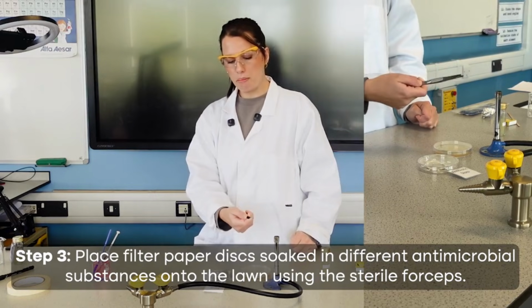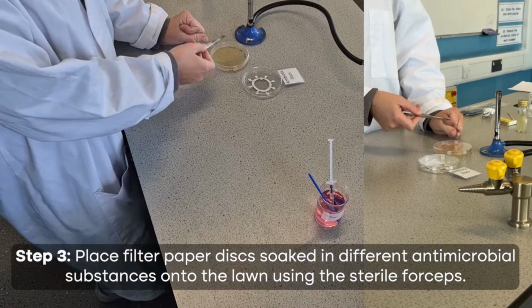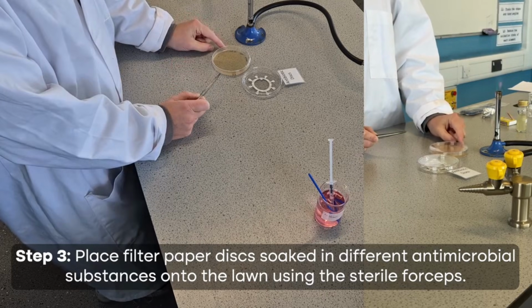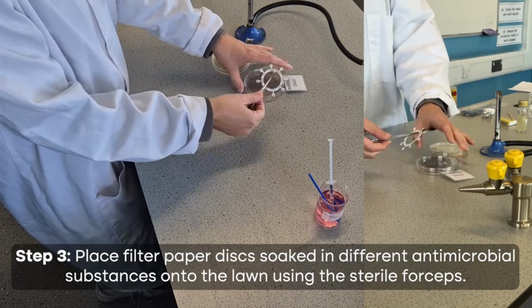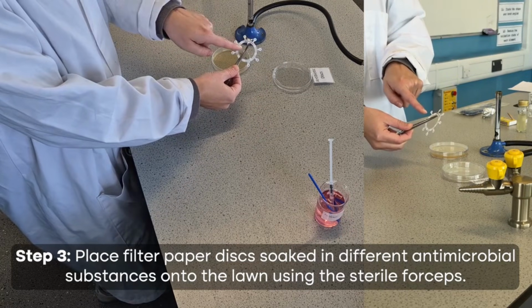But because I've now put them in the Bunsen burner, I do just need to leave it a little bit to cool down so it's not going to kill any microbes if it does touch that. Now this has actually got a little bit here on the mast ring. That's what we call this ring of antibiotics that I can hold onto with the forceps.